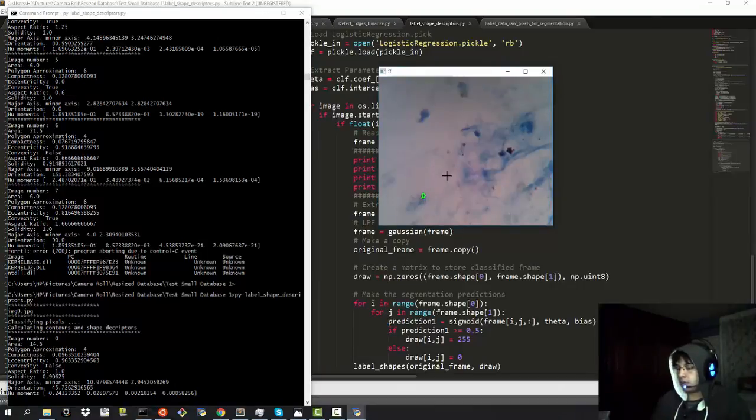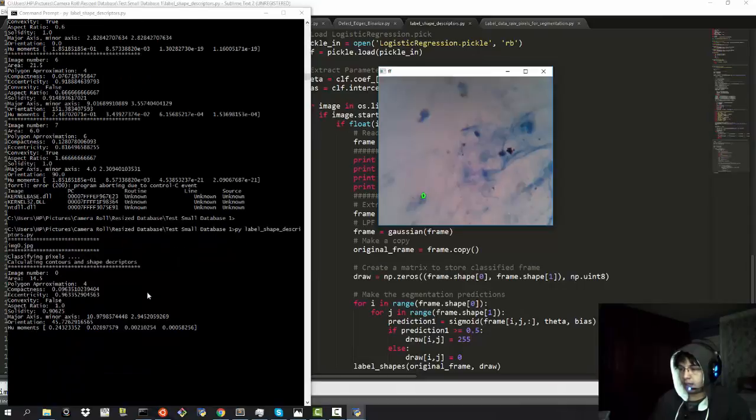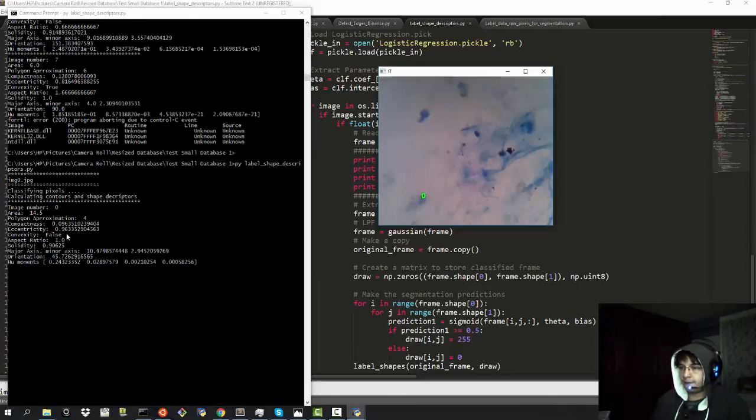So this is the image that it reports. I can show you here the reported features of our first object that the segmentation procedure has detected. We have it marked with a very thick green contour. And there is another screen that you cannot see because it's on my laptop screen, and that magnifies this region of interest, so that you have the features and the region of interest, scaled up, so that you can make a good labeling.